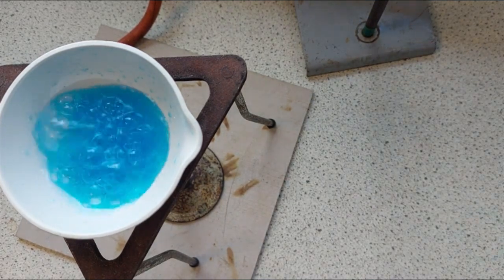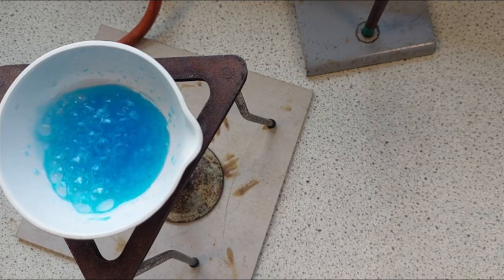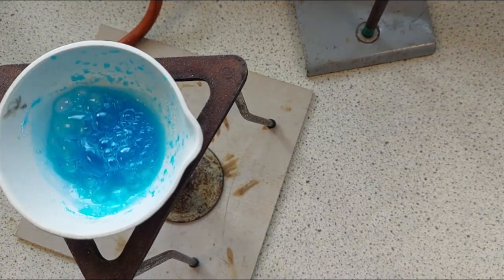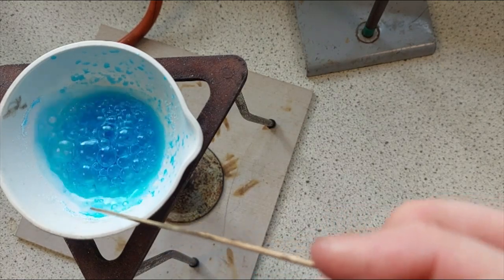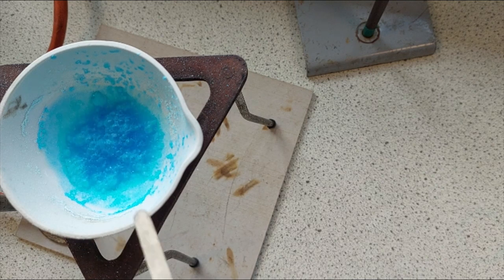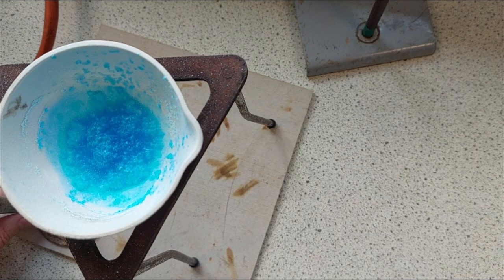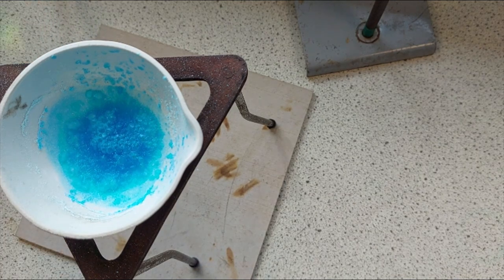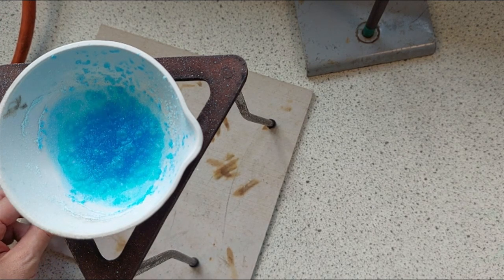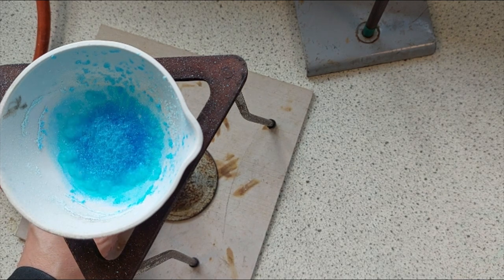I'll just point that out with a splint here. So just around here, this side, there are some lightly coloured crystals forming. Just there, you might just be able to see them. Again, just pointing out, we've got a lot more crystals appearing on this side now. You can see some appearing there. As you can see, the liquid is almost all evaporated away now. You're getting this film across the top. The copper sulfate is beginning to form. Interestingly, we can show it's copper because if we ignite it, you can see a green flame appears. That is a characteristic colour that copper gives off and emits when it is burned. I'll give this a little bit more of a heating, and then we'll come back to it.